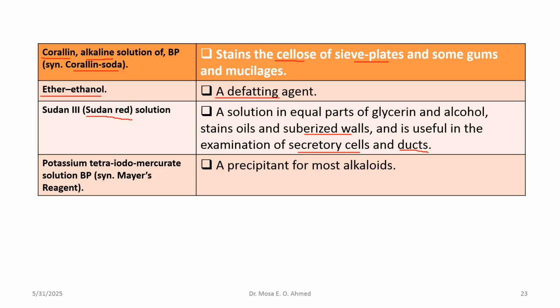The last microscopic reagent البوتاسيوم تترا أيودو mercurate اللي هو known as Mayer's reagent وده well-known reagent using for staining alkaloid-containing samples.